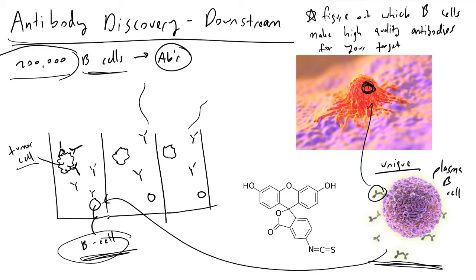And so what's going to happen here is that we're going to make use of a very similar process called sandwich ELISA. And this is somewhat analogous to it, in which we have antibodies from our B cell that have stuck onto some target, and these, the B cell antibodies, I will refer to as primary antibodies, and we will add in an additional antibody into our solution, and we'll let these float around, and these will be secondary antibodies. And I should use a different color, but I'll just describe this process because I didn't think that far ahead.